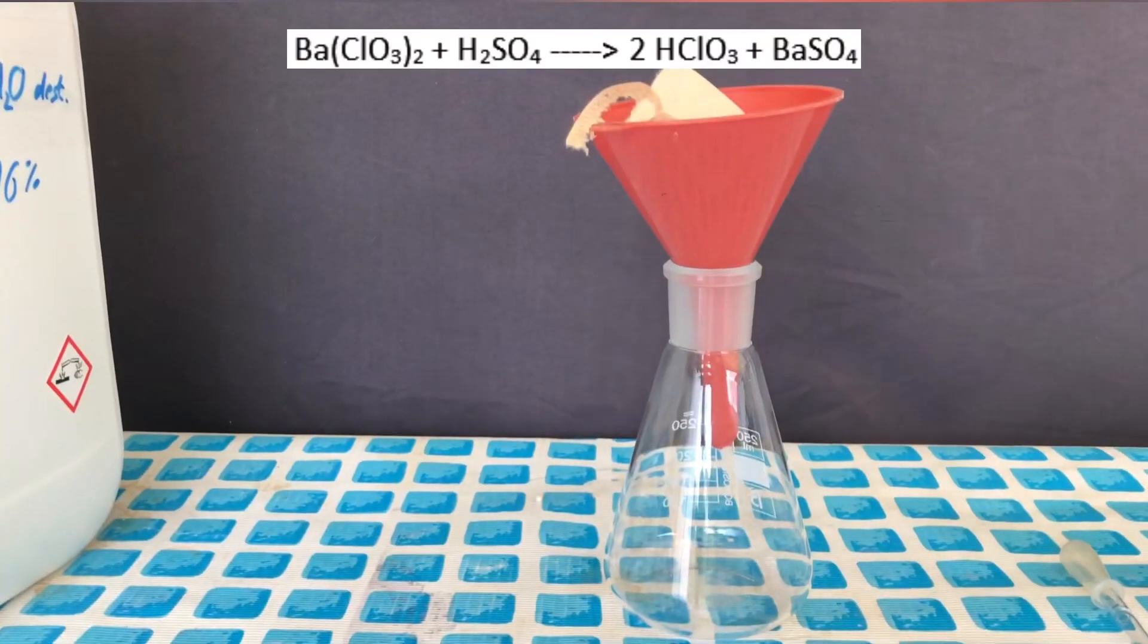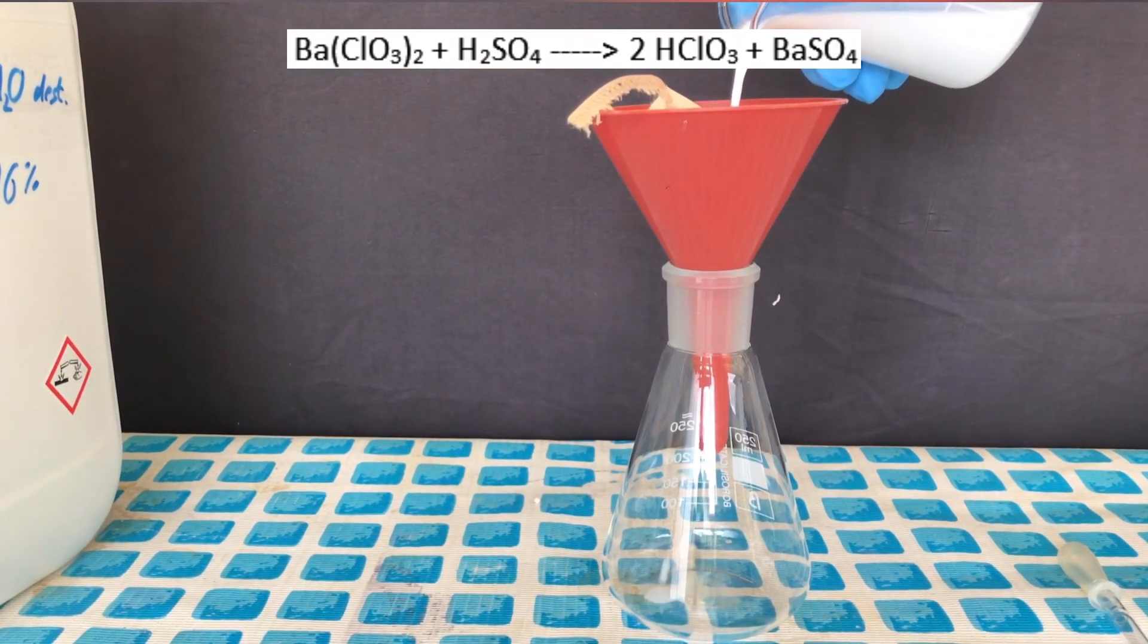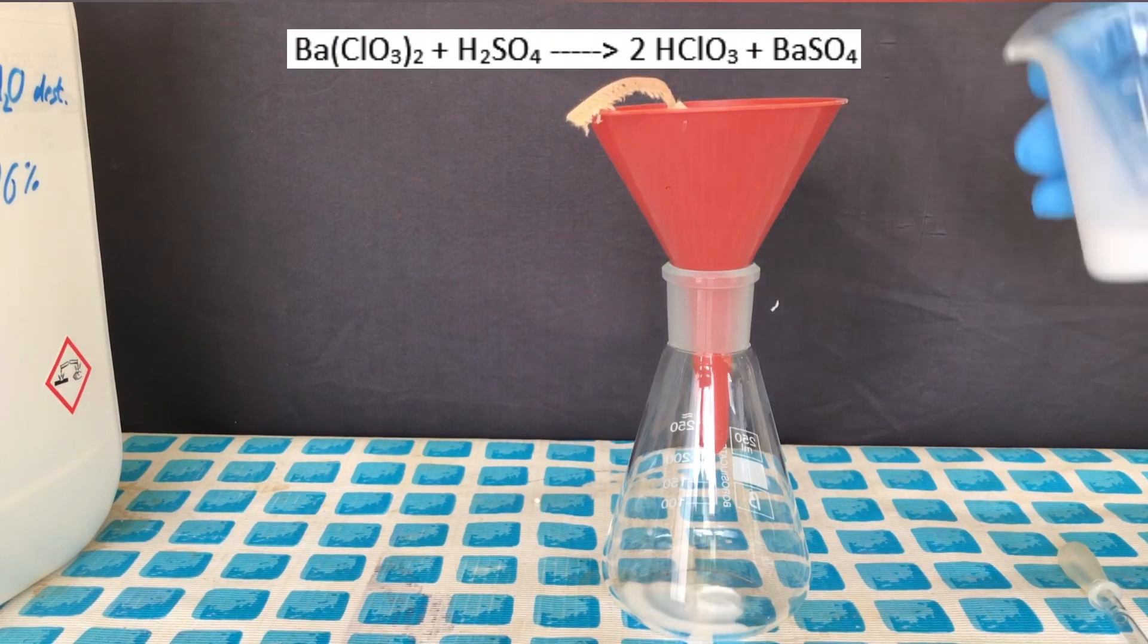The reaction taking place is the following: barium chlorate reacts with sulfuric acid to form barium sulfate, which is insoluble in water and crashes out, and chloric acid.